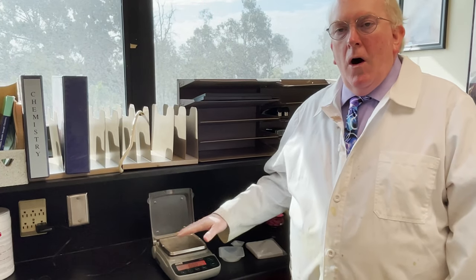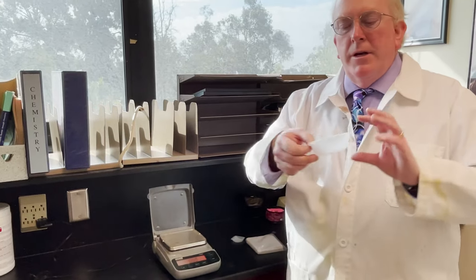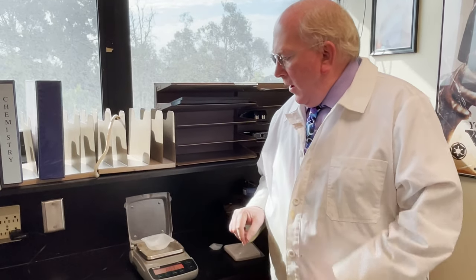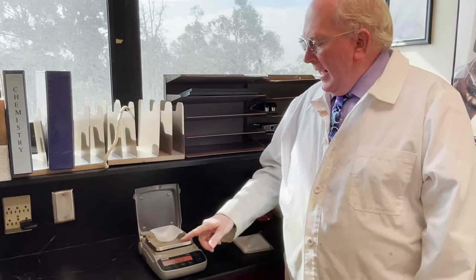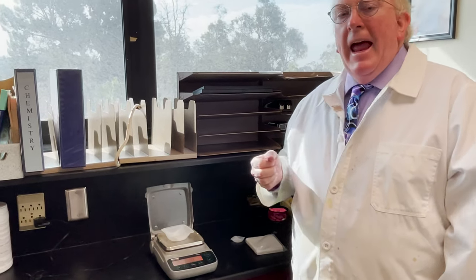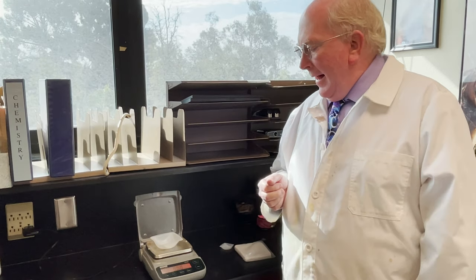We typically do not put objects directly on the balance pan. What we typically do is put a weighing boat, which is plastic and flexible, onto the pan. You can write down its mass and subtract it from numbers later, but more conveniently you can just push the zero button and it zeros it out. Some people refer to that as taring — T-A-R-E — to tare the balance.